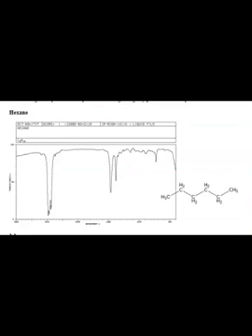Let's first look at this example of hexane, and this is an IR spectrum, so that's what we call it. It's not a graph. I mean, it looks like a graph, and it's better if you call it a spectrum. Down here we have what is called the wave number. Now, on our absorption table, they called it the frequency. It's the same thing. And so we have this list of numbers between 4,000 all the way down to something like 500.